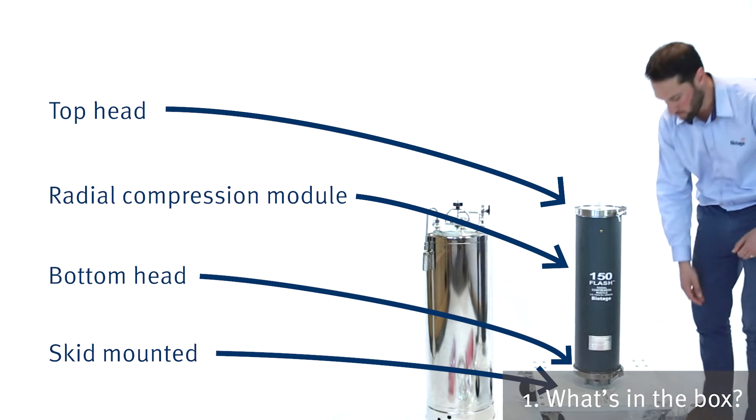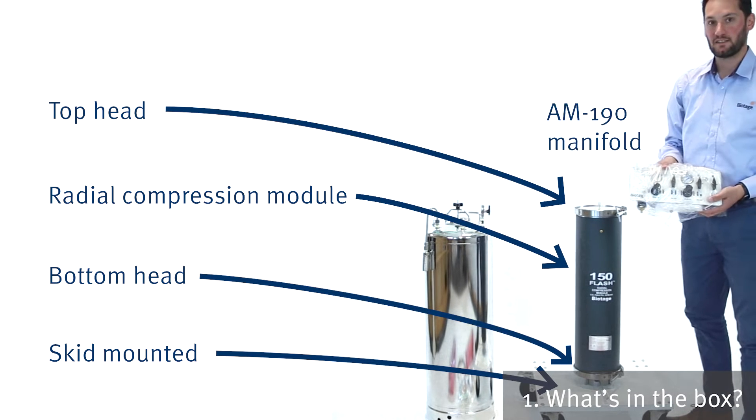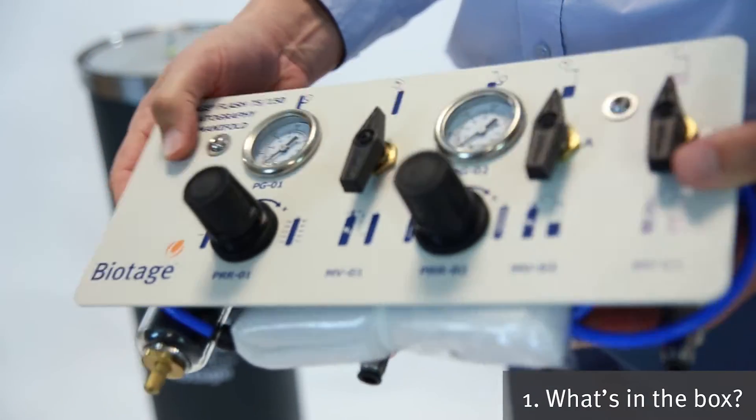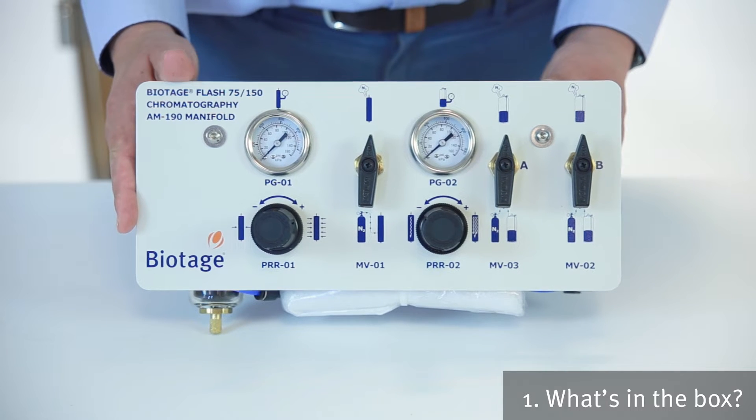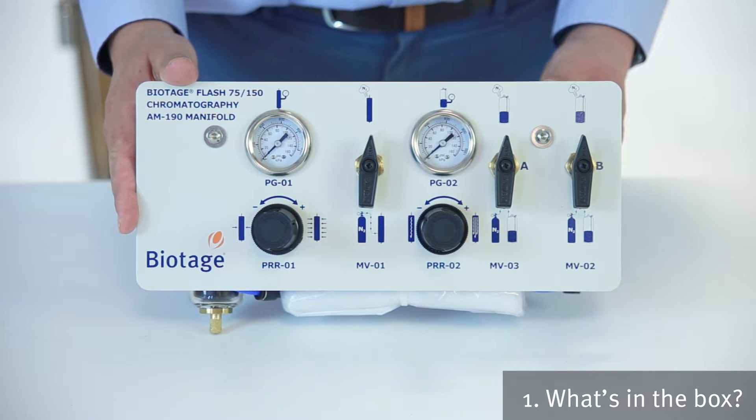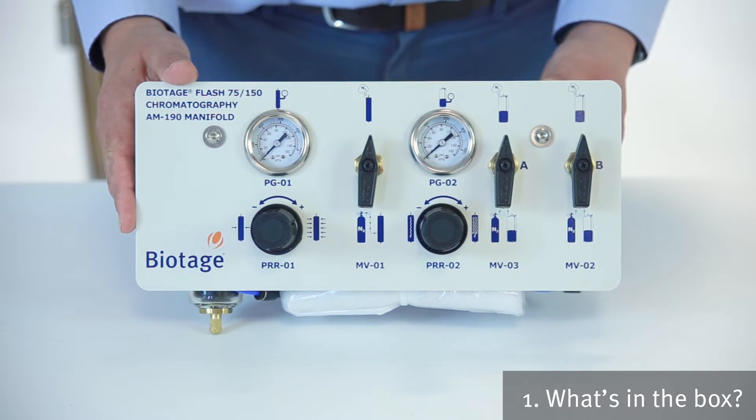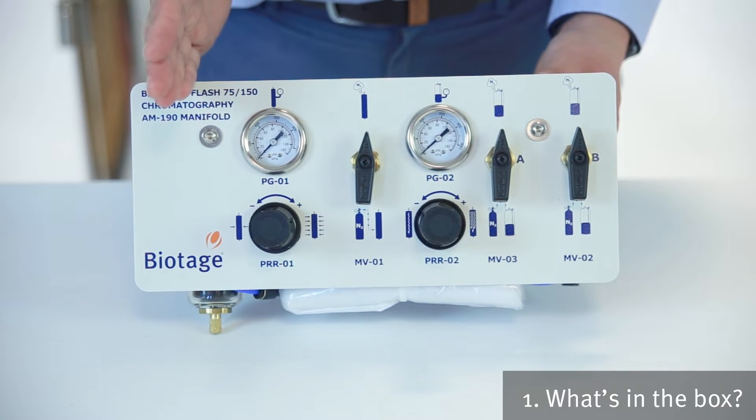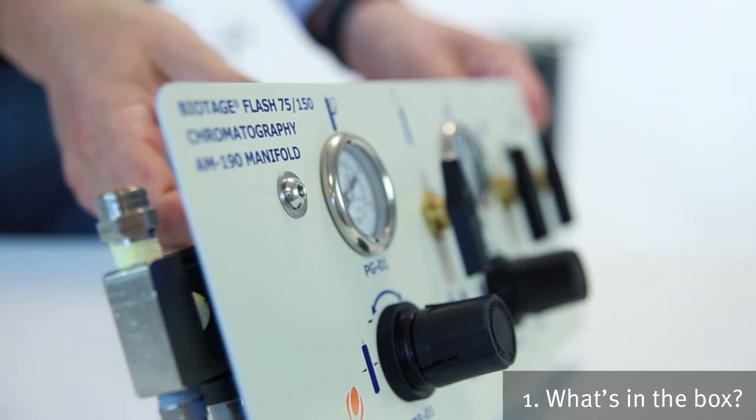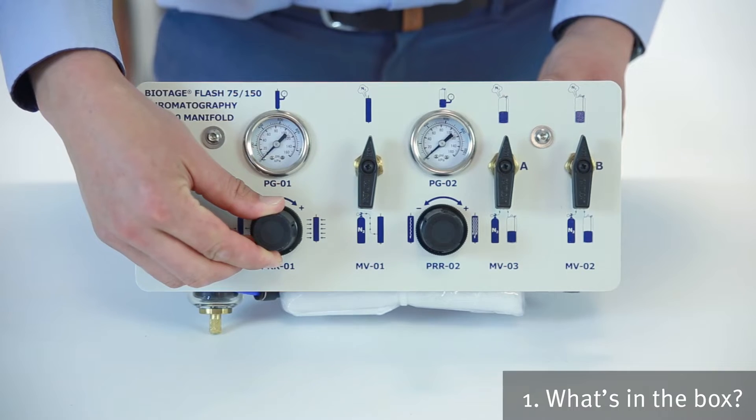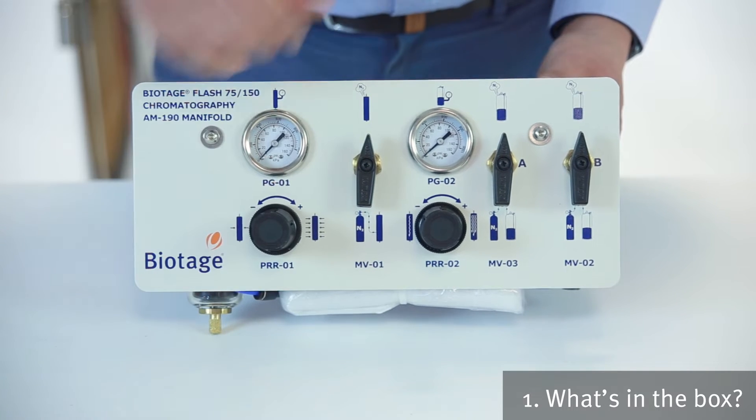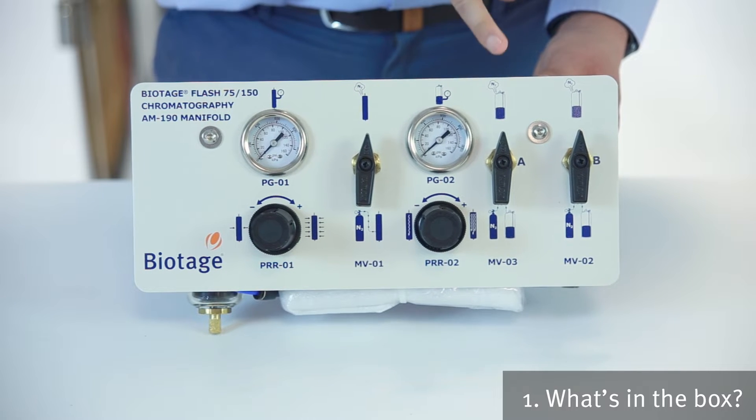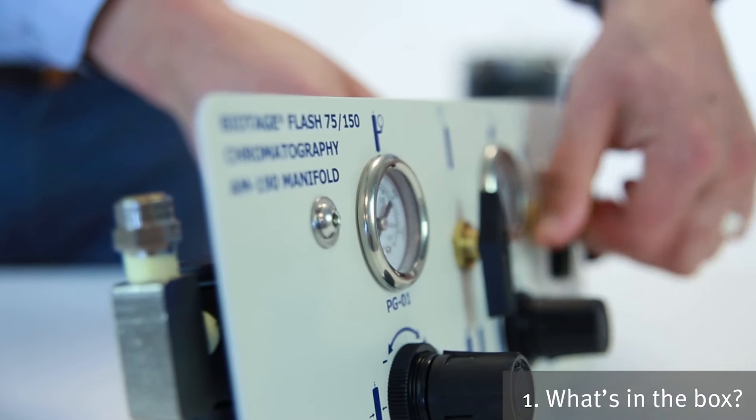All of that's controlled by the AM190 manifold. This is the manifold which is used to control all the various gas pressures. Setting the system up working from left to right across this way. This valve here is setting the overall pressure on the system and we set the pressure for the radial compression module, and then you've got two solvent lines here which are controlled with this valve.